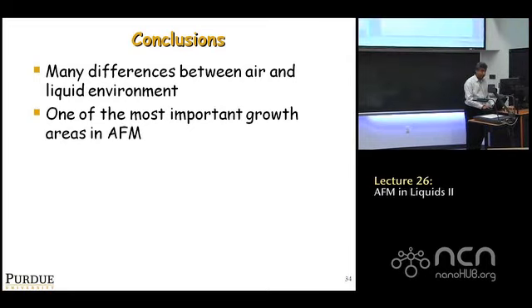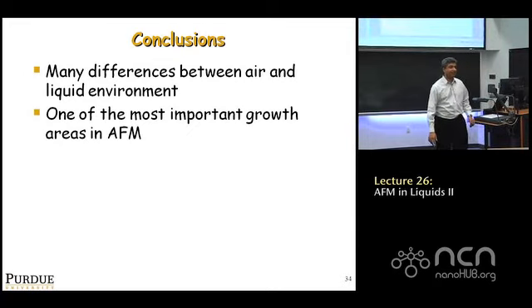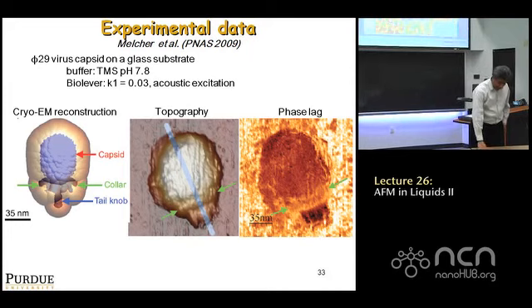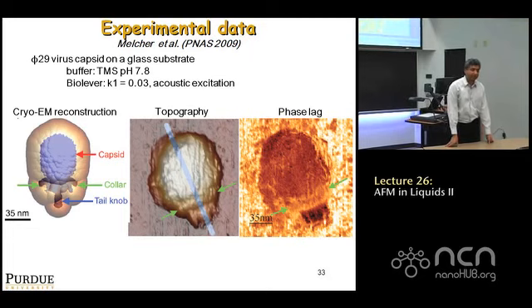Yes? Can I ask my question? We do have a cryo sample. That was a comparison of the image we get with an AFM with that taken from cryo-EM, which you can get from databases online.